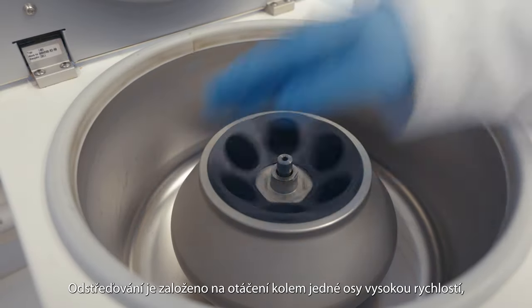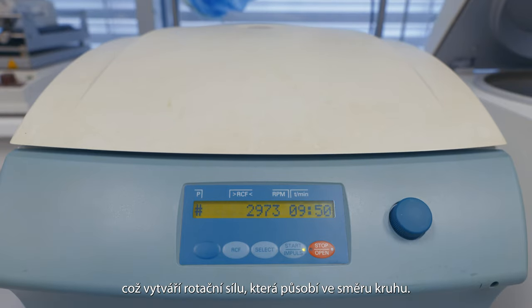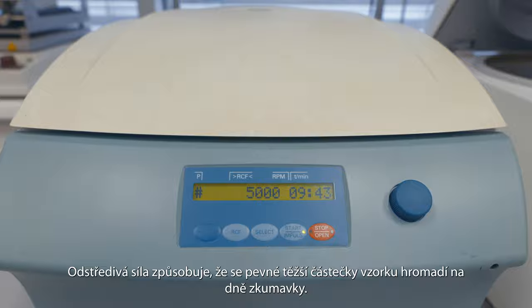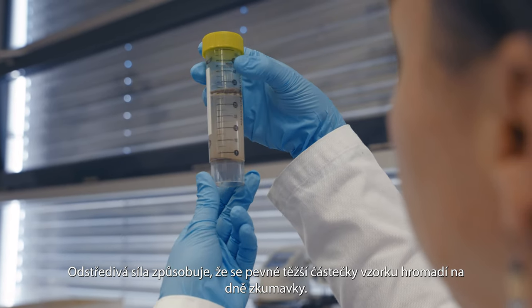Centrifugation is based on rotation around a single axis at high speed, which creates a rotational force that goes in the direction of a circle. The centrifugal force causes the solid, heavier part of the sample to accumulate at the bottom of the tube.